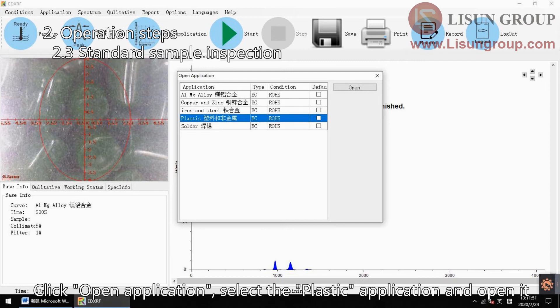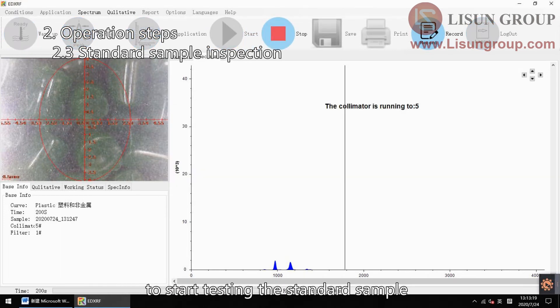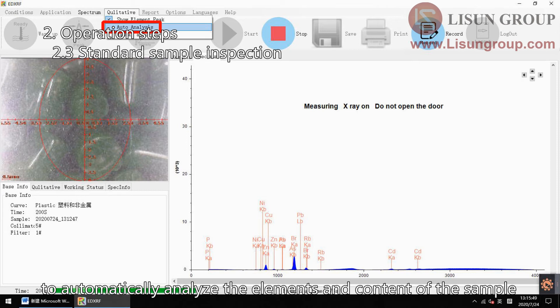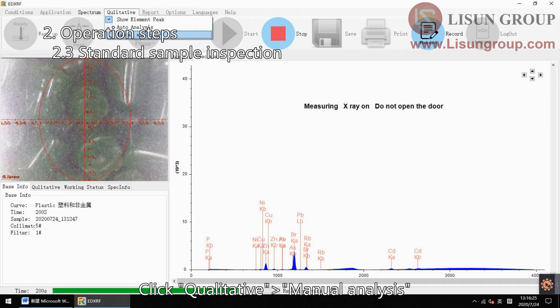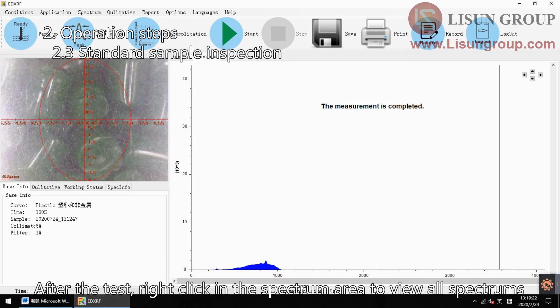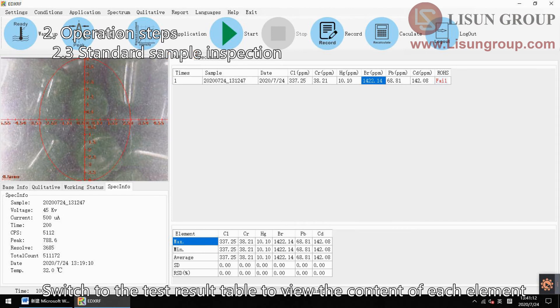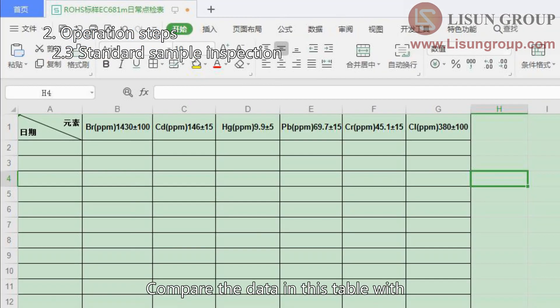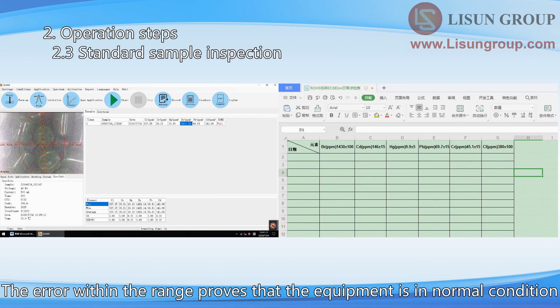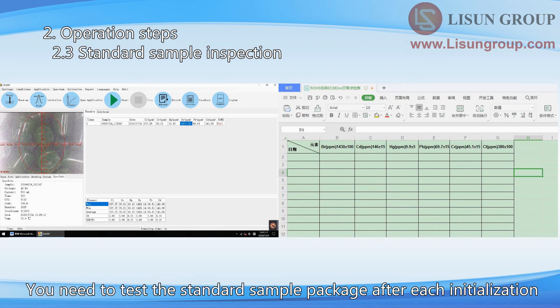Click open application, select the plastic application and open it, then click start. Enter the sample name and click confirm to start testing the standard sample. During the test, click qualitative auto analysis to automatically analyze the elements and content of the sample. Click qualitative manual analysis to manually add other elements you want to analyze. After the test, right click in the spectrum area to view all spectrums. Switch to the test result table to view the content of each element. Compare the data in this table with the data of the standard samples provided by Lasun. The error within range proves the equipment is in normal condition. If the error is out of range, please contact us. You need to test the standard sample package after each initialization.